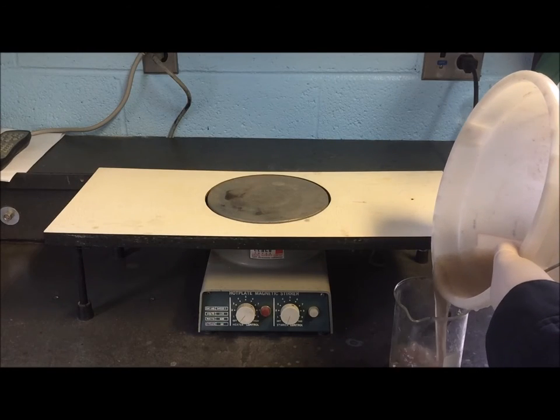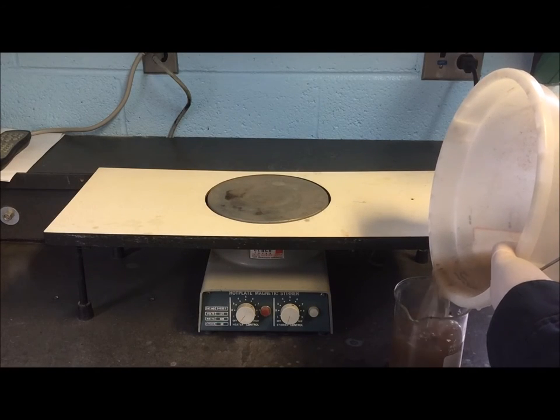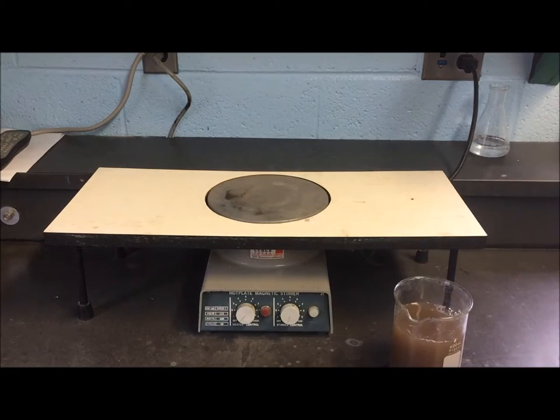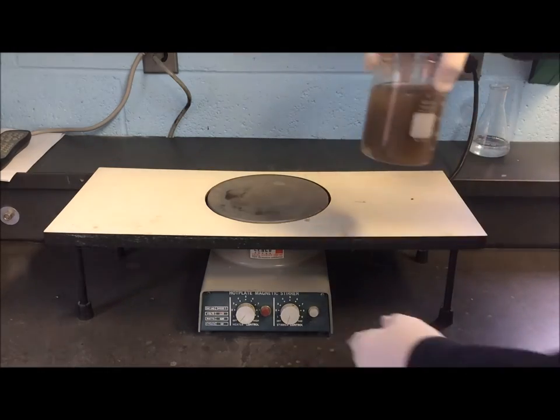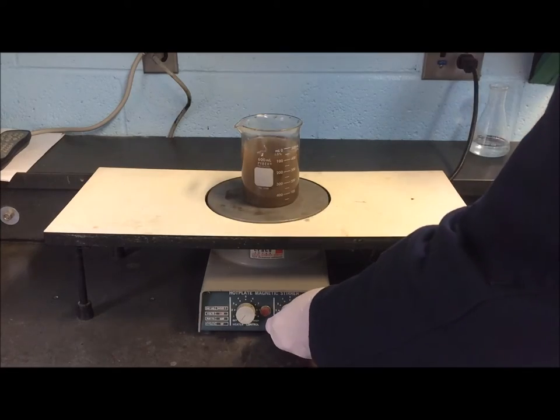We take another sample and pour it into a glass beaker. The beaker is placed on a magnetic stirrer to keep the sample well mixed.